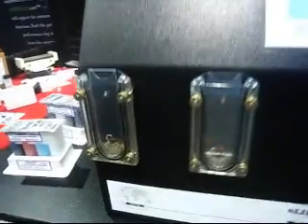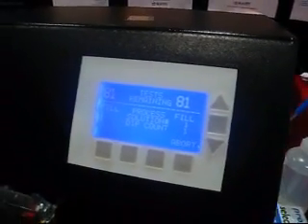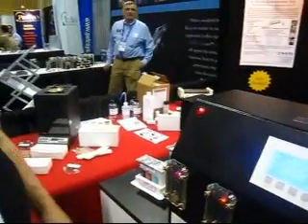At this time, all you do is press start, and the instrument will tell you how many tests you have in each chamber. And as you can see, the fluid is now moving up in each of the cuvettes.